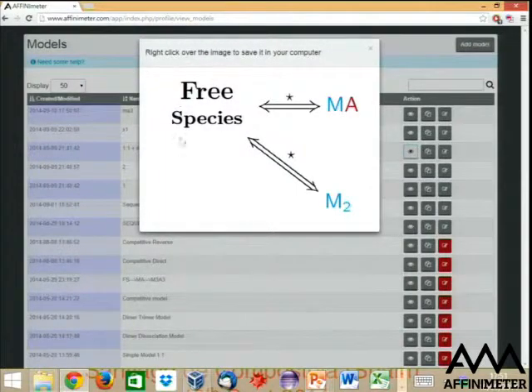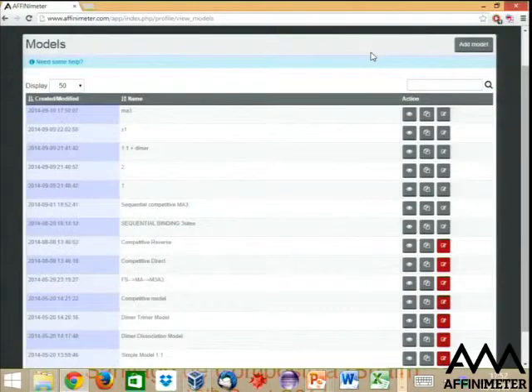And you can see that very easily we can design a complex binding model with multiple equilibria, but also sometimes you just need 2 equilibria to define a realistic system that, well, sometimes it's not easy to solve because we lack the appropriate binding model. So as I was saying, this would be the end of this first tutorial.